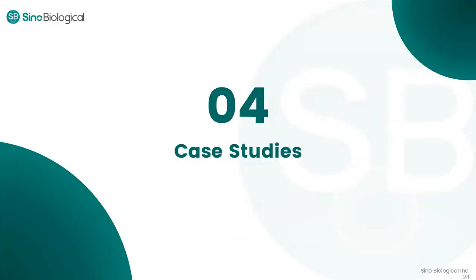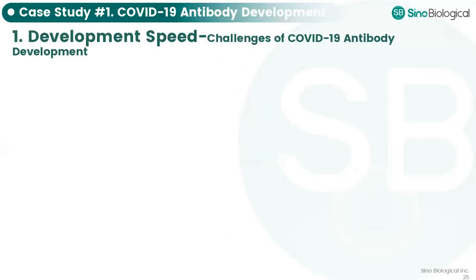Then we'll move to the last part of the presentation. We want to show some results when we make our antibody products in-house, and also the challenges we're facing and the solutions we will use to solve the problems. And the first case is about a COVID-19 antibody development. I think I don't need to spend more time talking about what COVID-19 is.